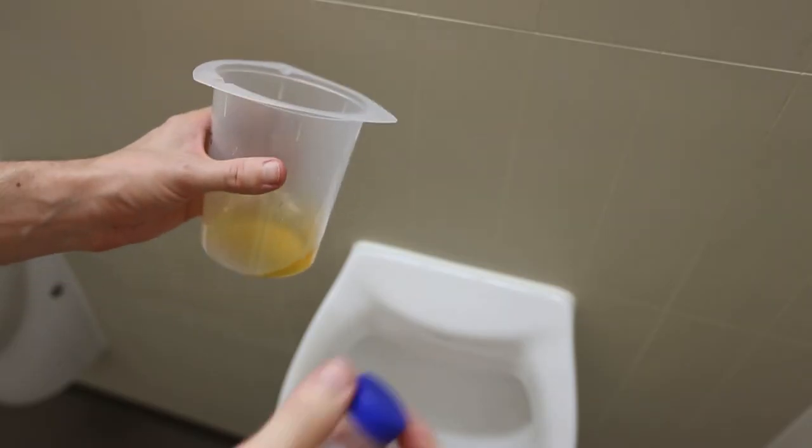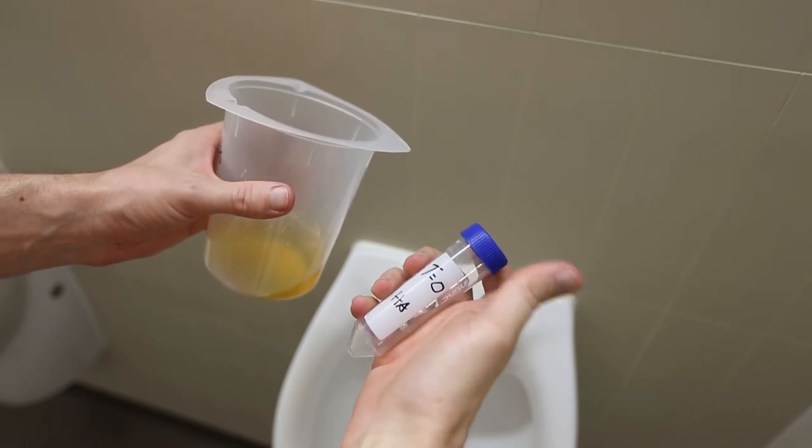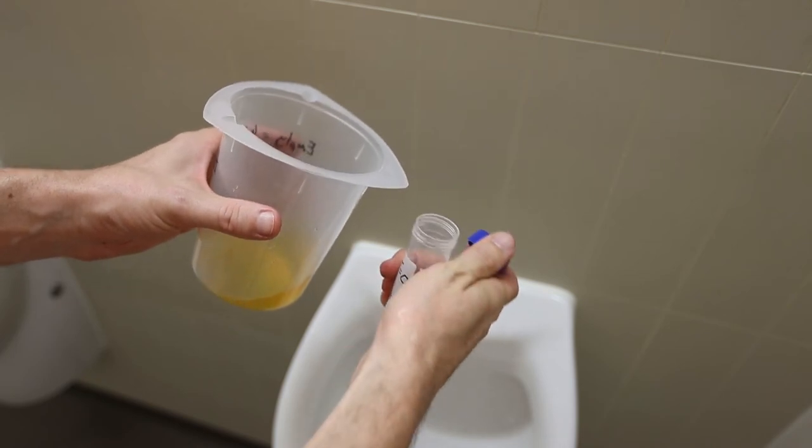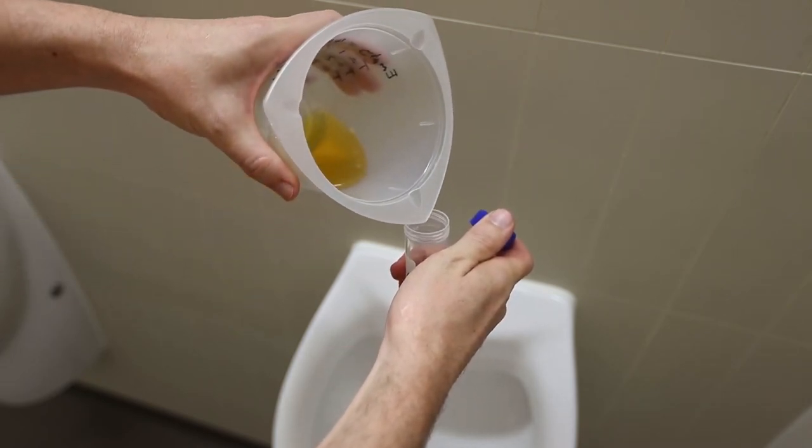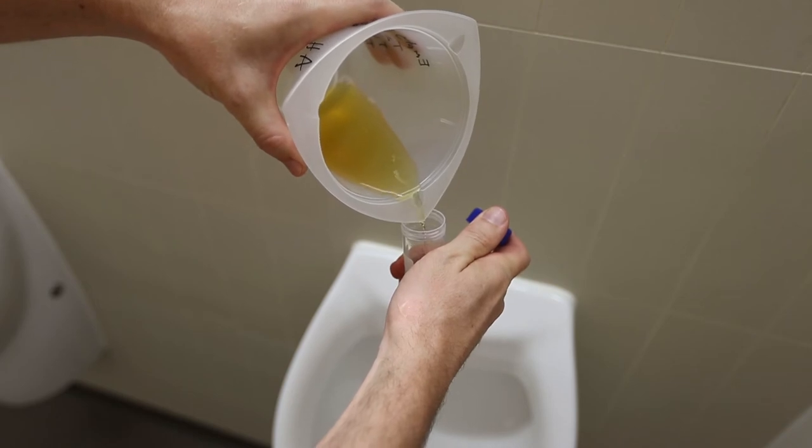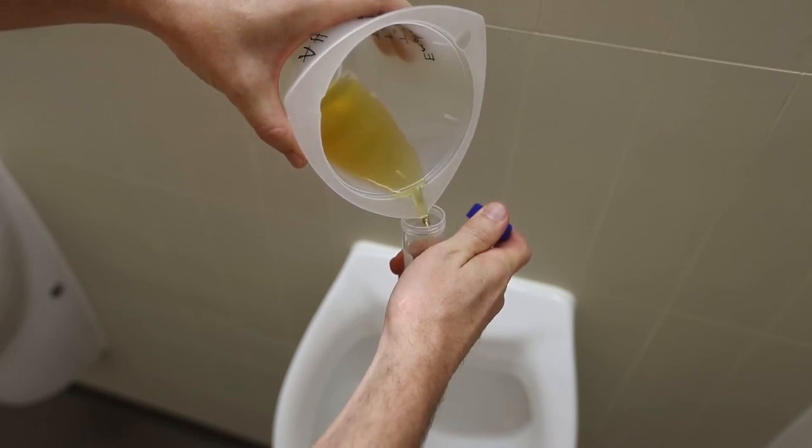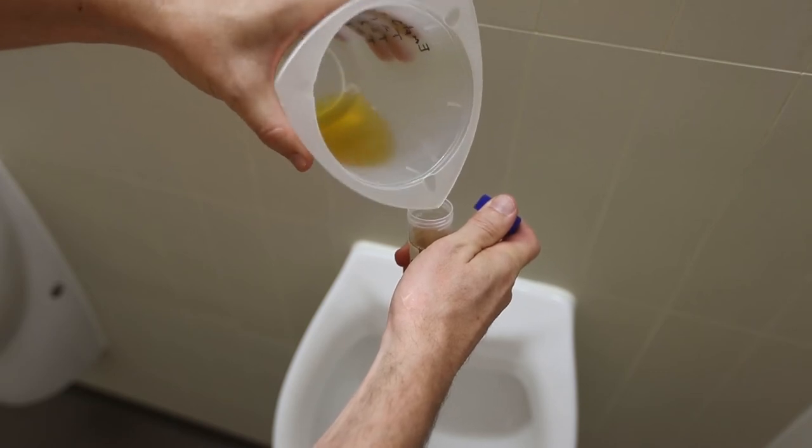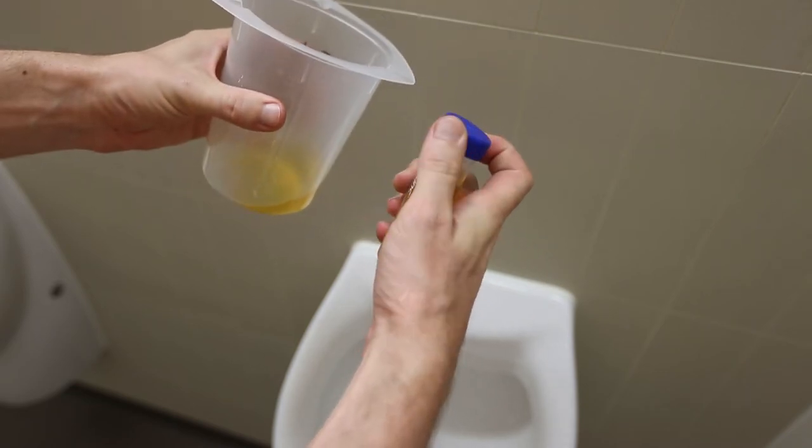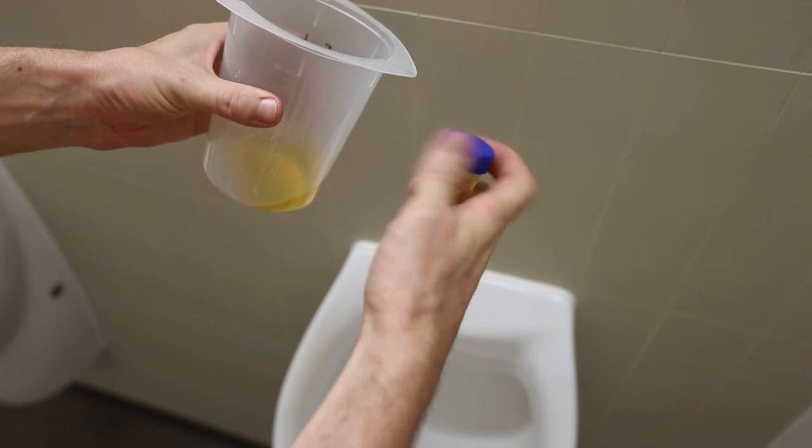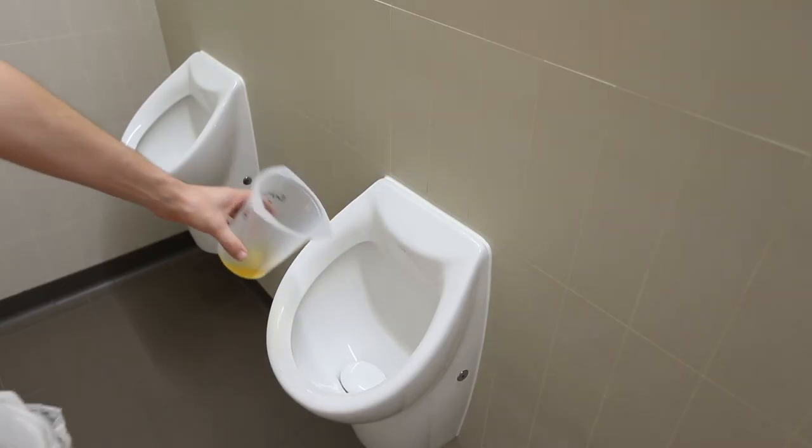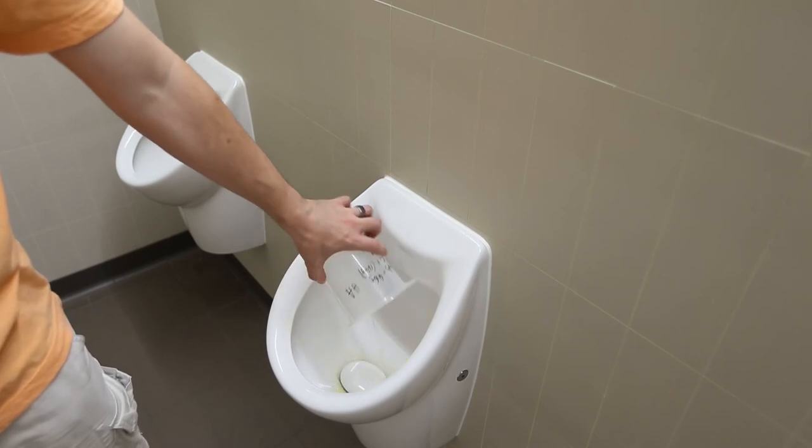Once you have measured the volume of your urine, pour approximately 45 ml of urine into the 50 ml falcon tube. Make sure you recap the tube tightly to prevent spills on the way back to the lab. Then dispose of the remaining urine into the toilets.